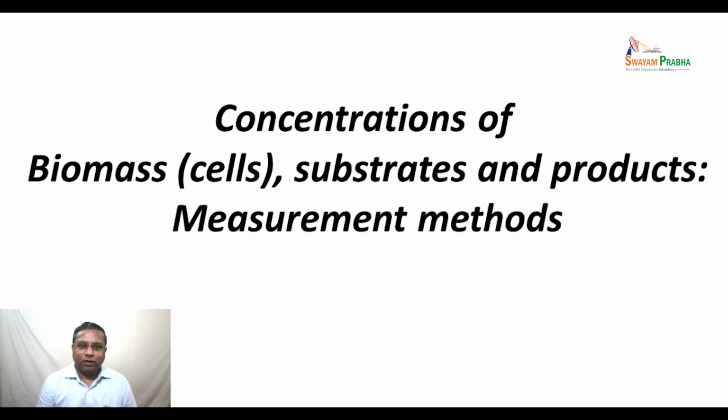We saw how crucial the information on biomass concentration, substrate concentration and product concentrations were in terms of kinetics, in turn the design and operation of relevant reactors. Therefore, we need to have good measurement methods to find out the concentrations of biomass cells, substrates and products. We would look at some of the common measurement methods that are used for these.